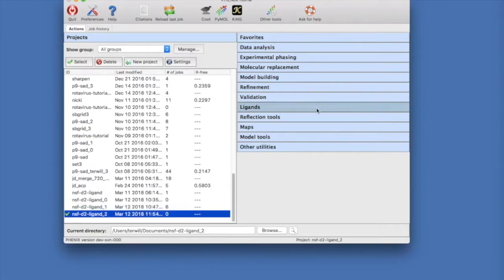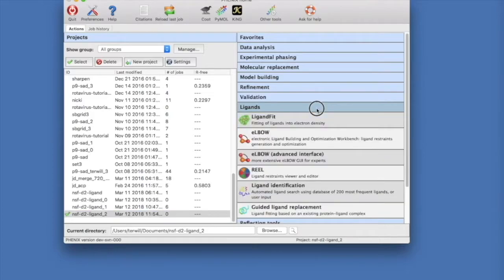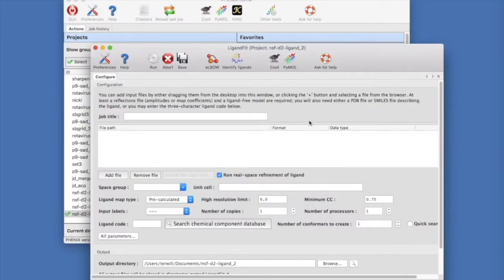In the main Phoenix GUI, select Ligands and then Ligand Fit. This will open a new Ligand Fit window. Let's put in a title. Now let's select our data.